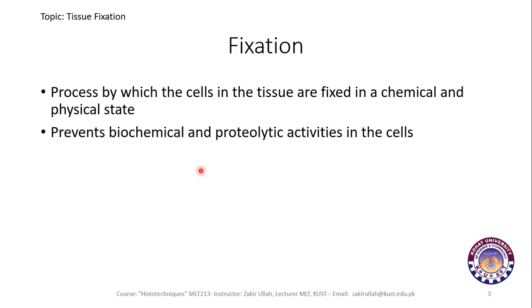because when the cell dies, certain biochemical activities start to destroy the cell, to decay the cell and to damage the important proteinaceous and non-proteinaceous parts of the cells. So, to stop those proteolytic activities, to stop damaging the proteins, fixation is important to protect the cells from these sorts of activities.